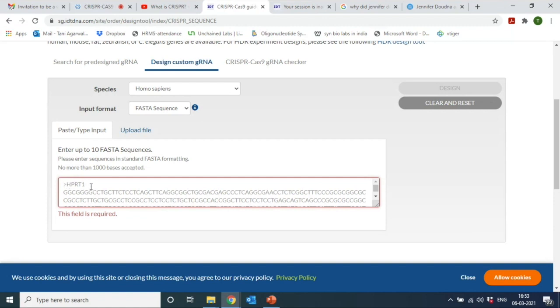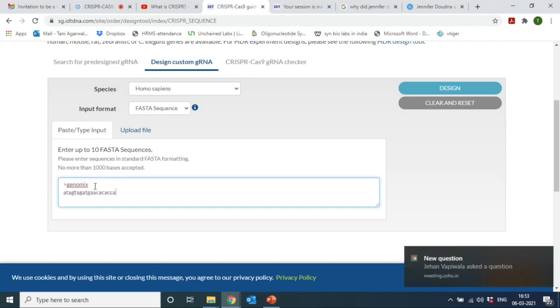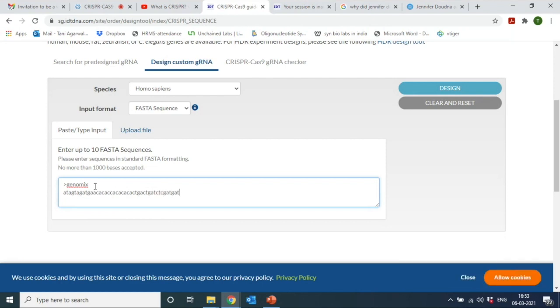I will put any name of my interest, say genomics, and then follow it up with an arbitrary sequence on the next line.